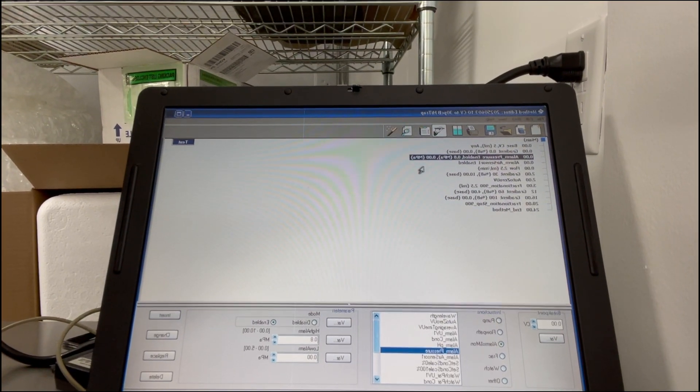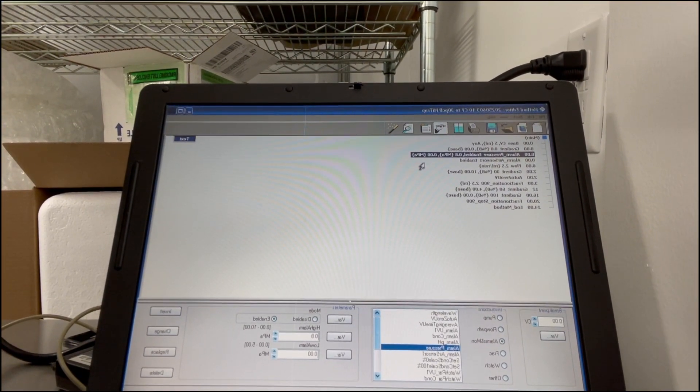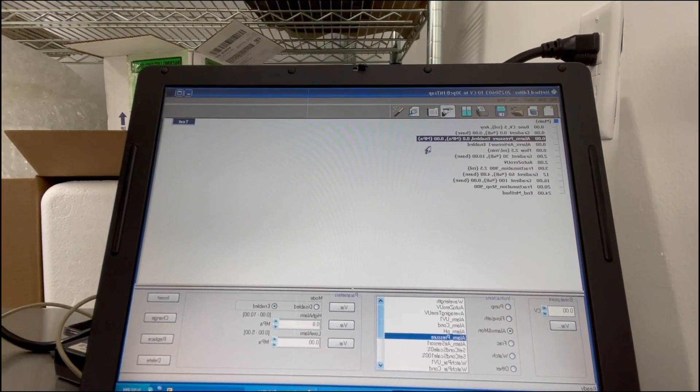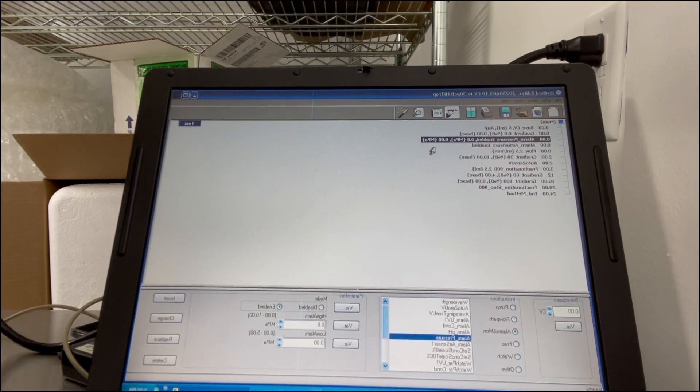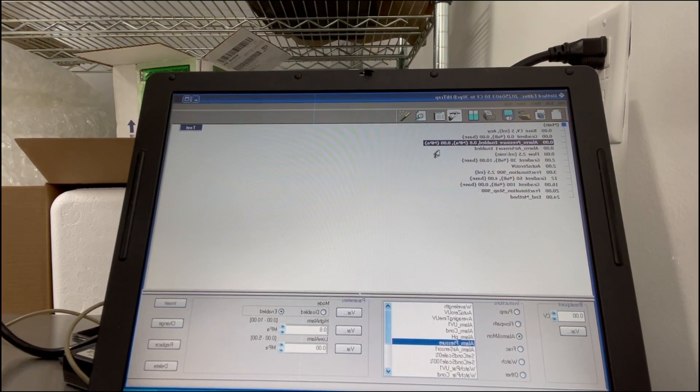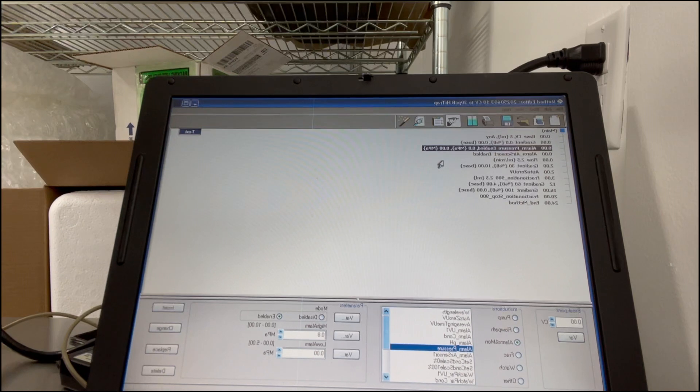I set the alarm pressure to 0.8. That's because the column has a high pressure limit of 0.4 and the system already has a pressure of 0.4. So anytime it goes above 0.8 I want it to shut down the pump rather than crushing my column.